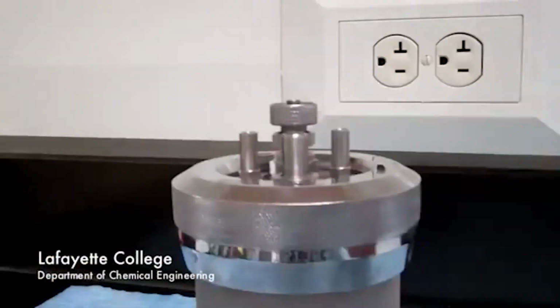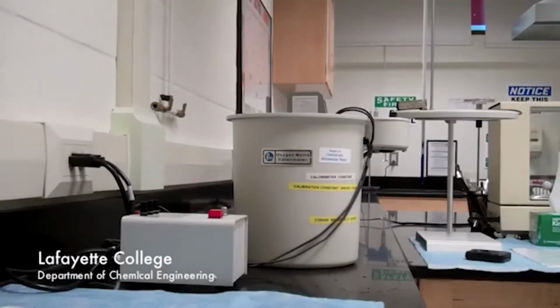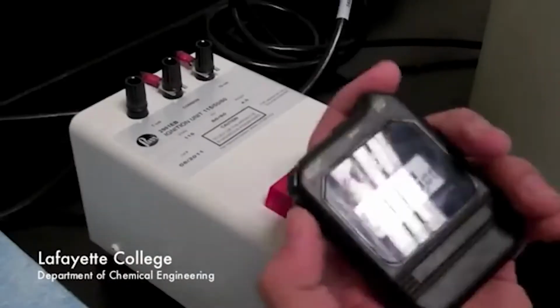Foods are weighed, mixed in a blender, freeze-dried, ground into a powder, and then finally formed into a pellet. This pellet is then placed into a bomb calorimeter where it's ignited and measured. Those facts aside, bomb calorimetry and measuring nutritional calories are outside the scope of Quantitative Chemistry Lab I, so you don't need to worry about them for this lab.